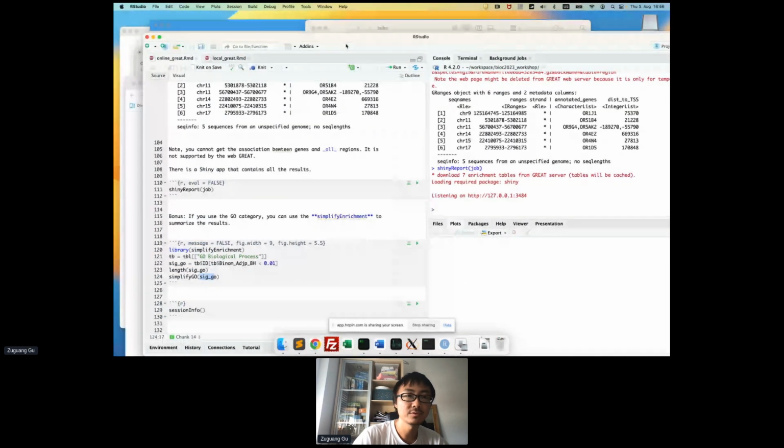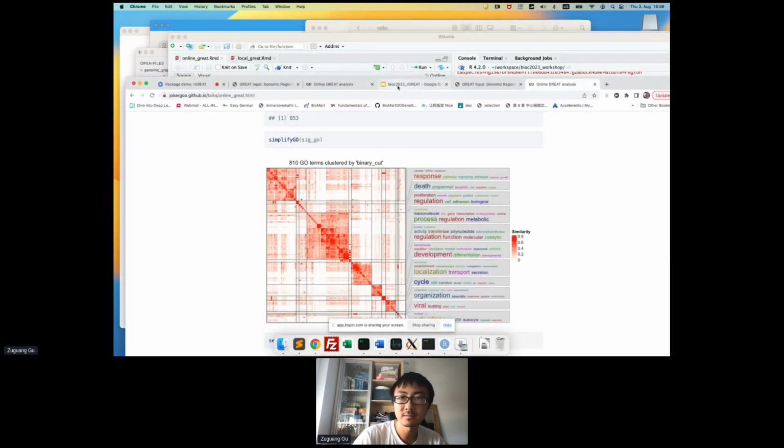Okay, now we continue to introduce the local GREAT analysis.